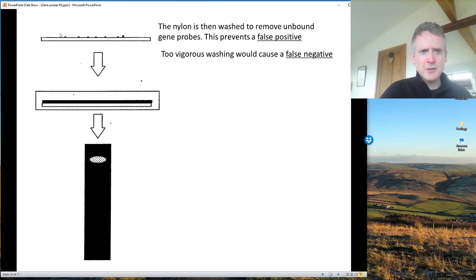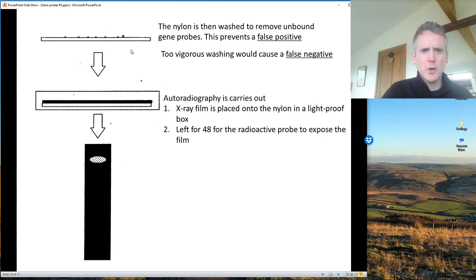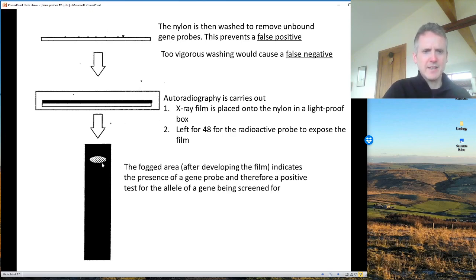I then need to visualize this. Remember, none of this is visible to the naked eye. The radioactivity is so minute here as well that we have to detect it over a long period of time. And you did a bit of this when you did about flow and movements and proof for the mass flow hypothesis. So we do something called autoradiography, where we put X-ray film on top, like all photographic film, and put it into a light-proof box. You leave it for 48 hours, and then the radiation from the gene probe will expose the film in that area. And when you develop it, you get this fogged area.